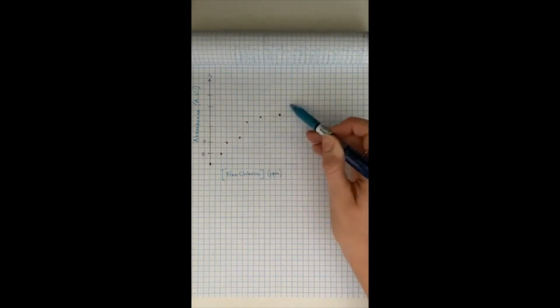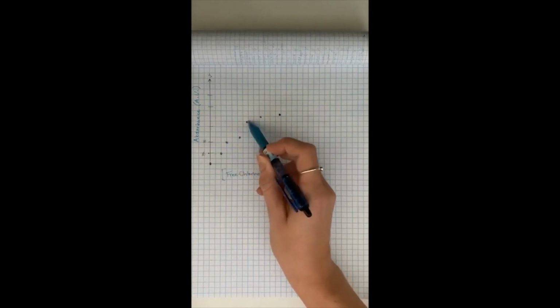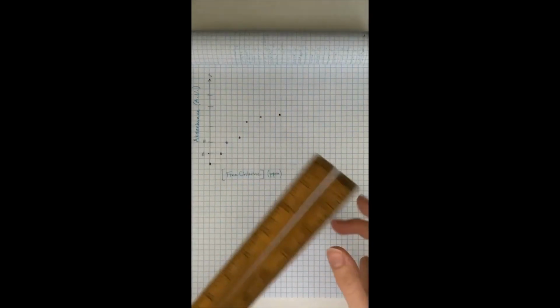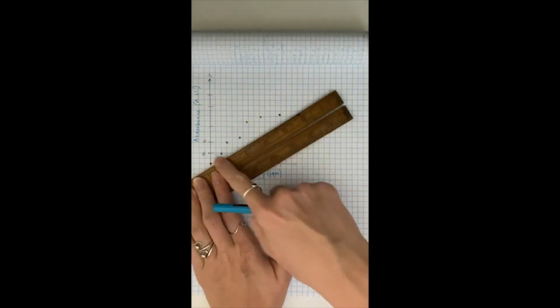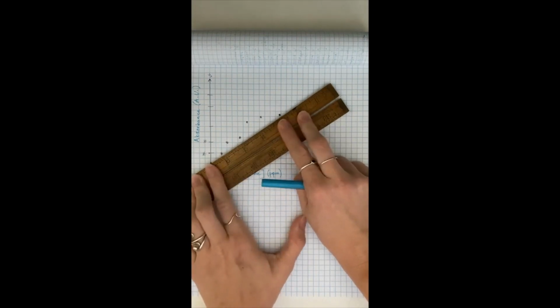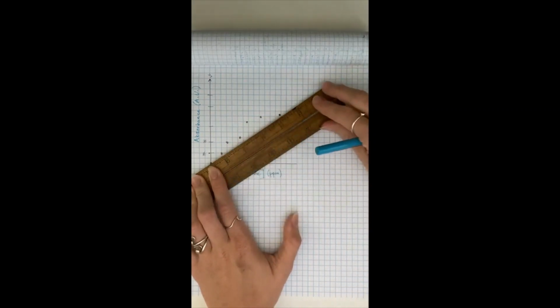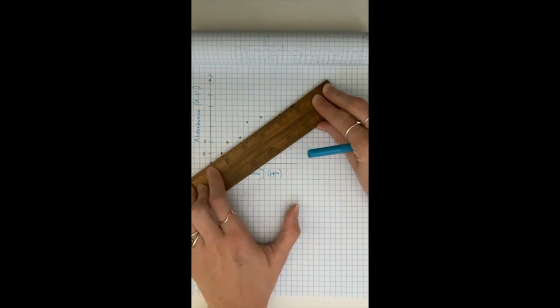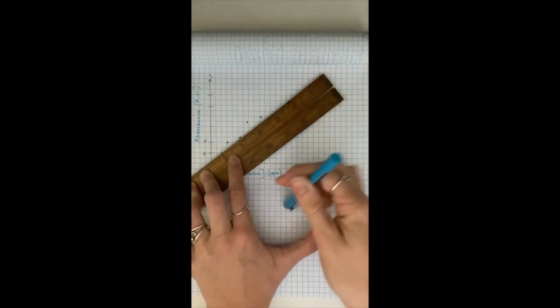So now we're going to do our line of best fit. I am not going to draw a line in between all of these. We're not doing that. What we're going to do is get our ruler, and generally you want to find the line that best represents the mean of these values. If I did the 2 endpoints, I don't think that's a great representation of all of these points. So I'm going to move this in a little bit, keeping base on this endpoint here at the blank, just move it in slightly so we can get a pretty good representation.